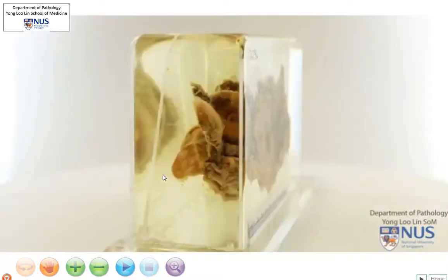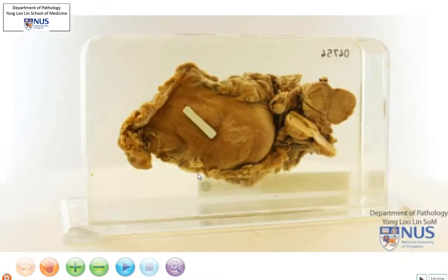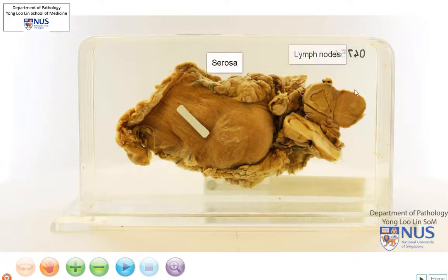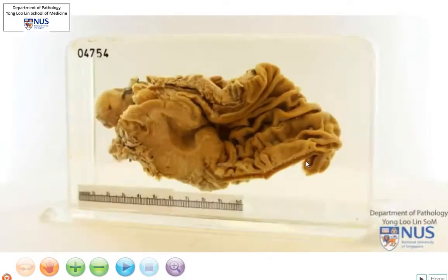Let's turn around and orientate ourselves a little bit more. Over here at the posterior surface, we're looking at the serosa of the stomach, and these are some very enlarged lymph nodes — we'll come back to them later.